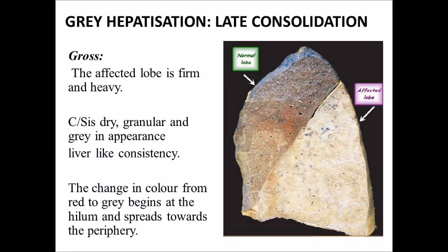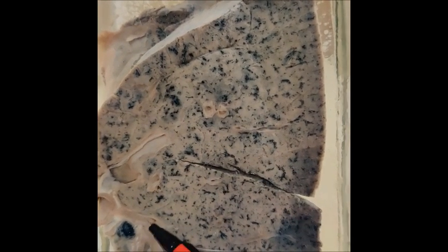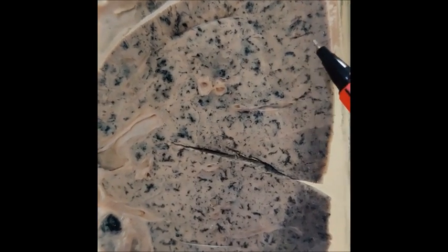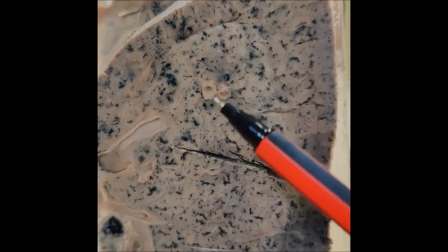So what is the change that we are seeing? See, have a close look. So the lung has, see, these are the bronchioles, the major bronchi you can make out here. So much of white areas here, and lung is normally having a pillowy consistency, very soft, but it looks like that consistency is lost. We are not touching here, but we can make out. Okay. And what is the color? All these areas, don't you think they are looking like liver? It is looking like liver.